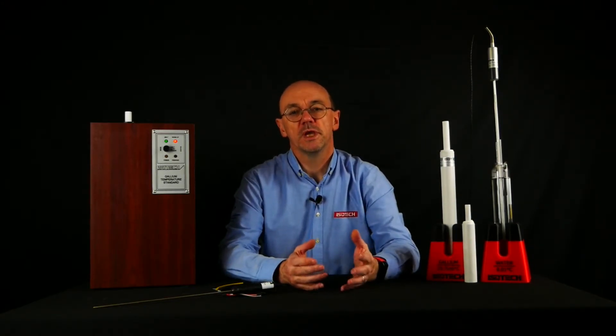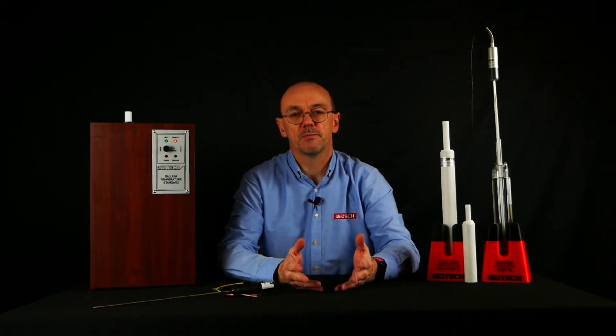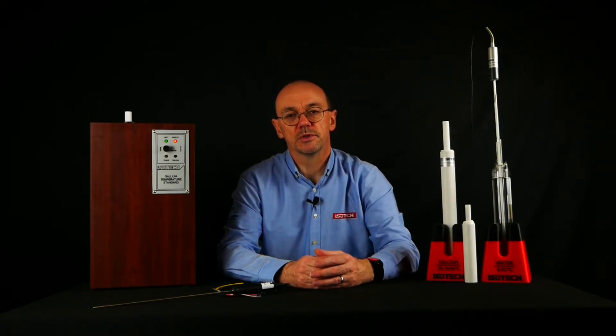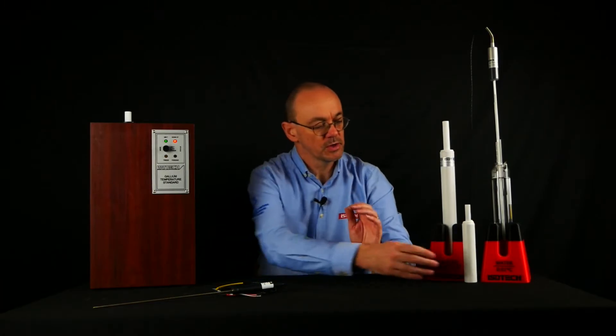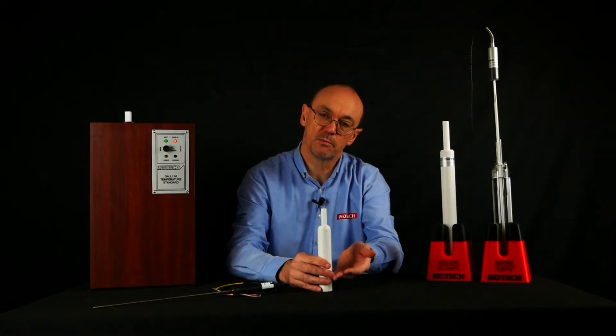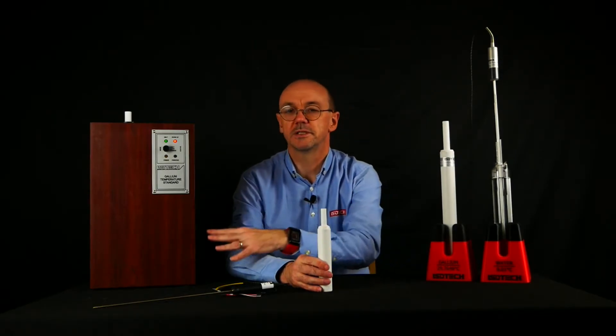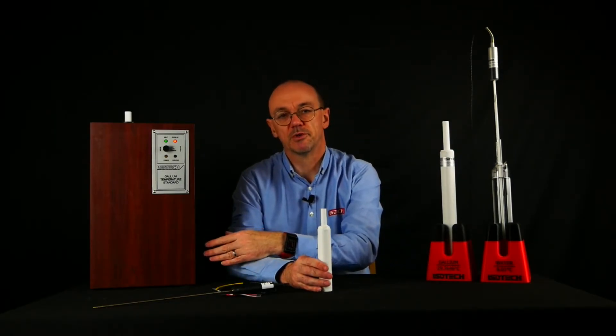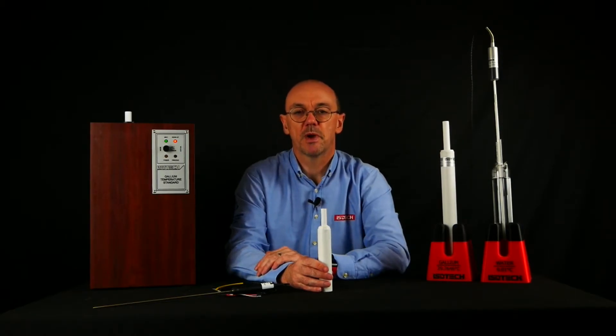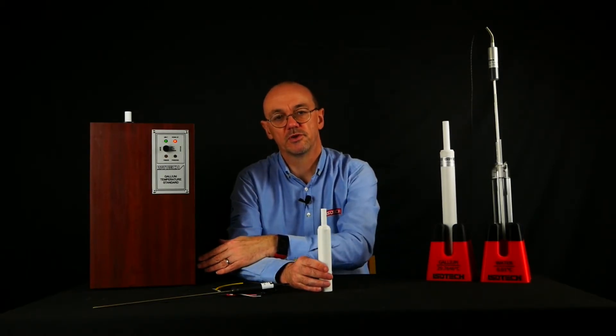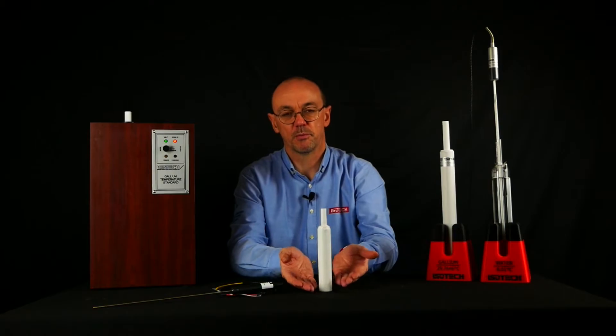When gallium freezes, it expands by about three percent. So it's important that the cell is arranged so it freezes from the bottom up to avoid stressing and rupturing the cell. With the Isotech apparatus, that happens automatically, and even with power failure the apparatus ensures the cell is frozen from the bottom up.